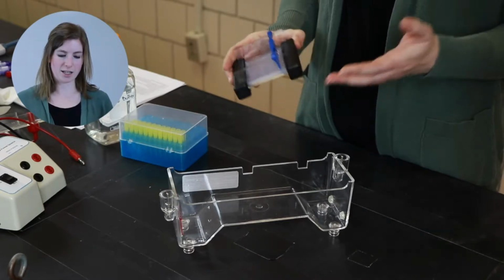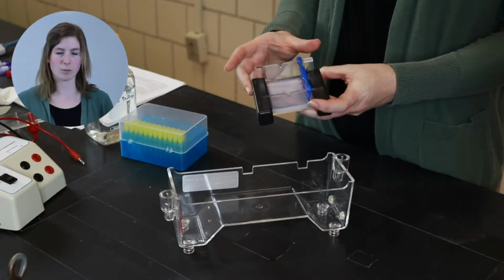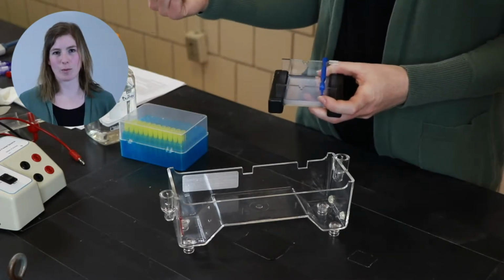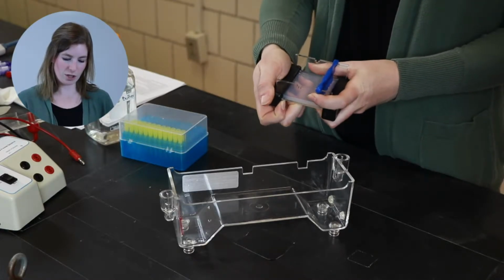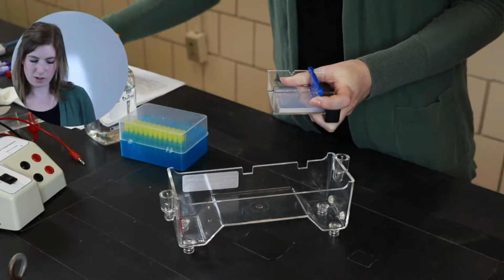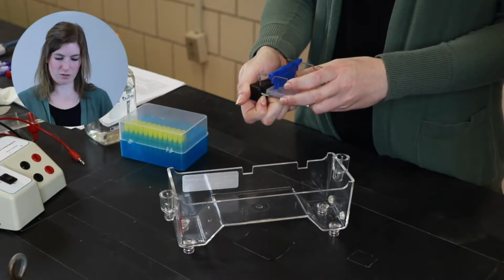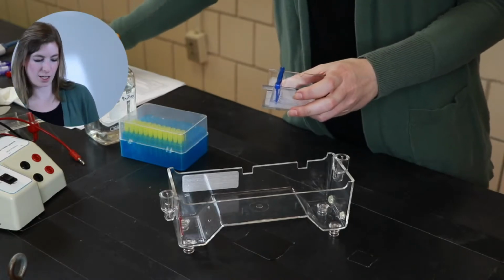So our first step is I've made these gel beds, and they're sitting in their molds, and I need to get them ready to load. To do that, I have to take off these two rubber bumpers on the end. I want to be really careful because if I just rip them off, my gel might split and rip. So I can do it gently, but it comes off pretty easily. I'm going to take both of these off. Otherwise, it won't fit into our little box here.